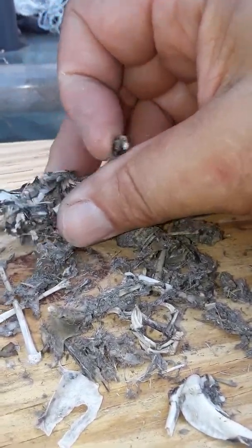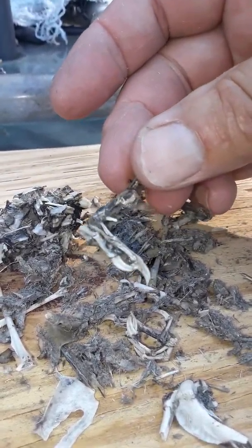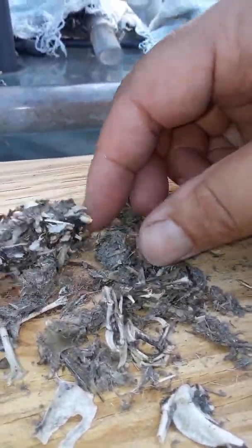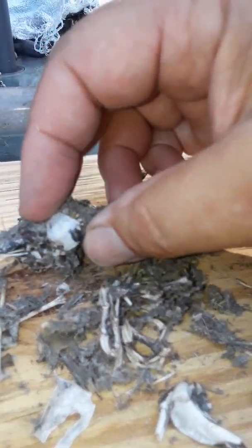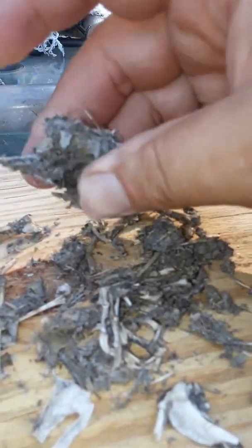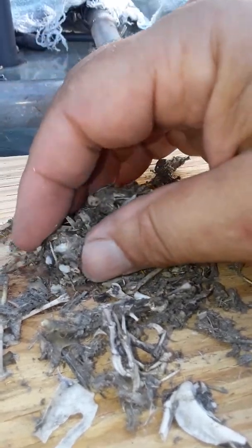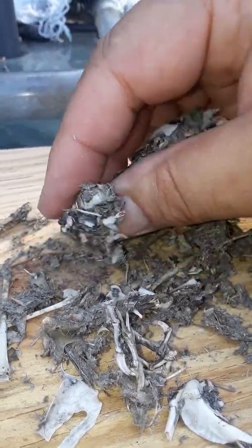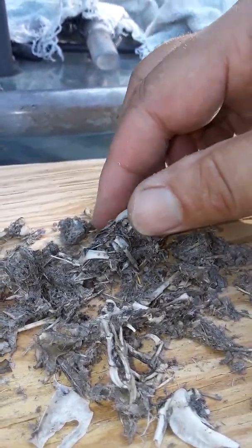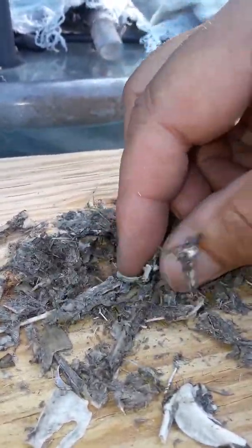There's a claw — there's a foot, that's an entire foot right there. See the toenails? What species, I don't know. There's another one — another foot, an entire foot. This thing is hard.